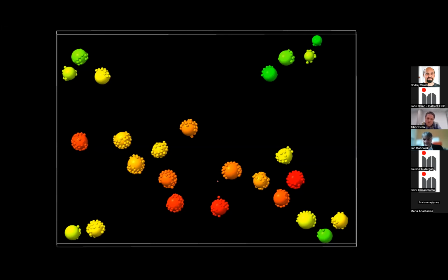Another cause is that we are doing this clustering recursively, looking for neighboring particles that are close enough. We are defining some 130 angstrom distance between the particles that are considered to be related, to be neighbors.